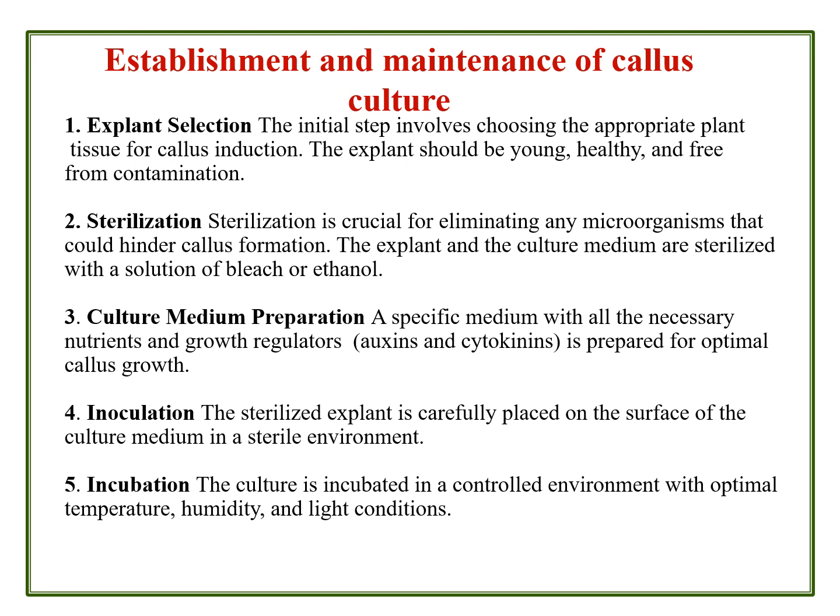Once the media is cooled to room temperature, immediately pour it onto the culture plates. Standard culture bottles, boiling tubes or petri plates can be used for pouring the MS medium supplemented with these plant growth regulators. Once poured, moisture must be avoided, since in a lukewarm condition the media always generates moisture on the upper surface of the upper lid of the petri plates.